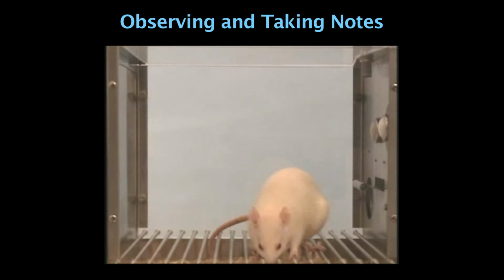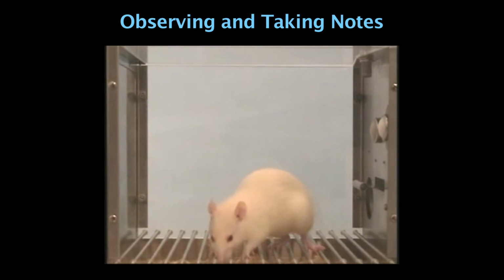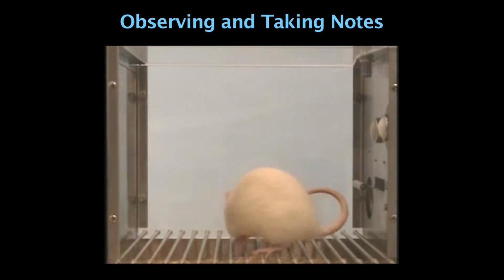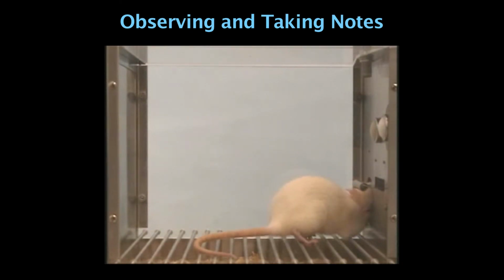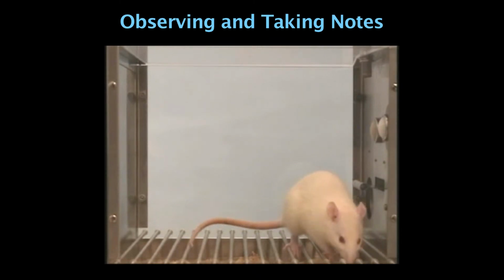If the animal has had prior training, we may even want to elicit some behavior. For example, here is a delivery of water with our sound recording turned off so that CyberRat can use the video source materials. And the animal licks and drinks, then moves around and explores the chamber some more.